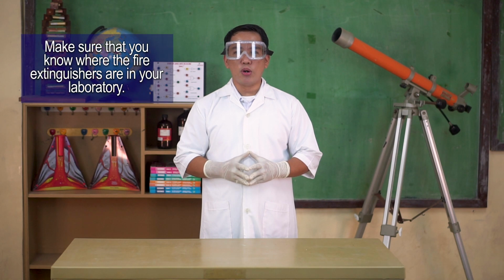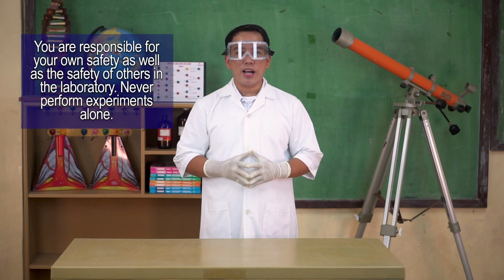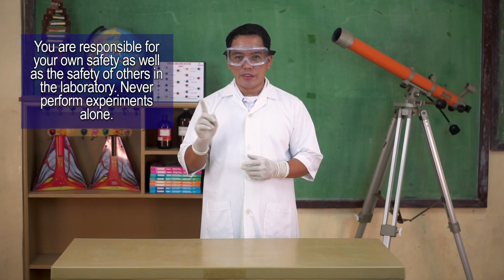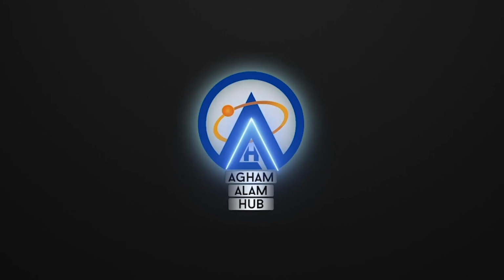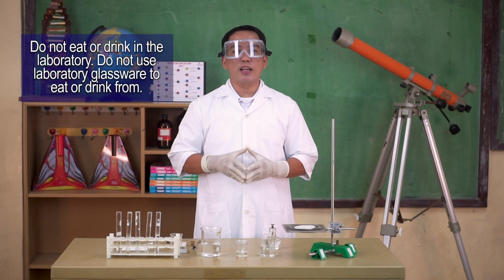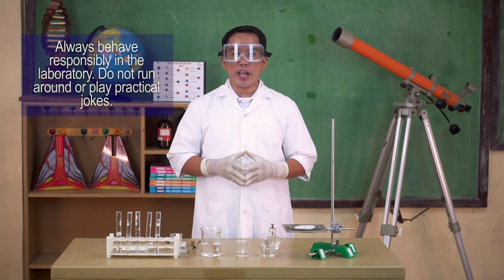Make sure that you know where the fire extinguishers are in your laboratory. You are responsible for your own safety as well as the safety of others in the laboratory. Never perform experiments alone. During an experiment, do not eat or drink in the laboratory. Do not use laboratory glassware to eat or drink from. Always behave responsibly in the laboratory.